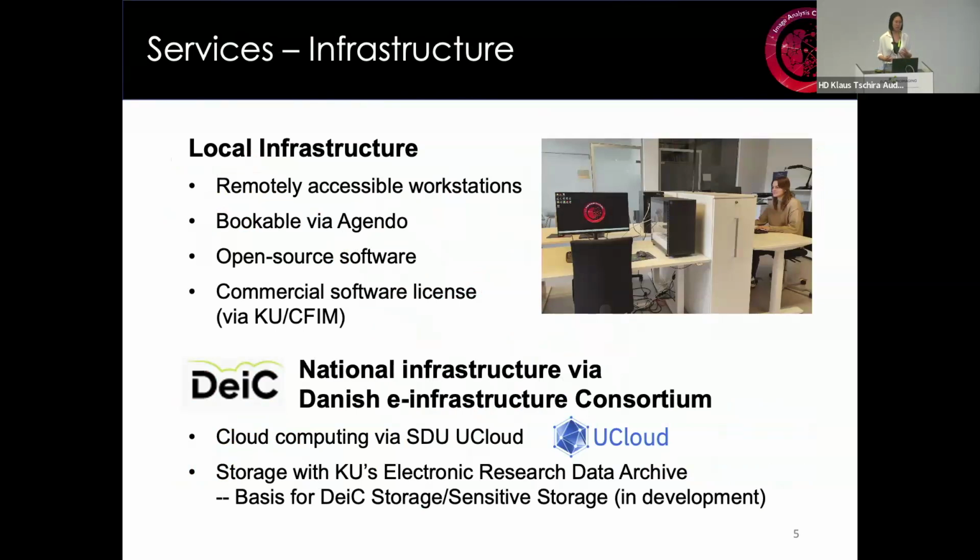And then we load it up with your usual open source software like Fiji, we've got Napari, the normal stuff, right? And since we also share an office with CFIM, the core facility for integrated microscopy at KU, we also connect users with the software licenses that exist there. So we shared the Imaris license with them, and through KU, we use the MATLAB license, and that's that.